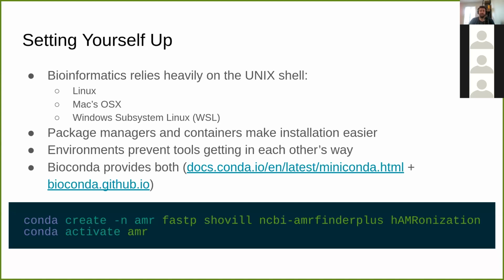And containers are a way of hiding your tools from the mess of your computer and packaging it all up in one go, a bit like a virtual machine if you've encountered them. Containers and environments are sometimes separate from package managers, because they stop tools getting in the way of each other. So if you install this tool, but it interferes with another tool that you've also installed, an environment lets you install them separately.